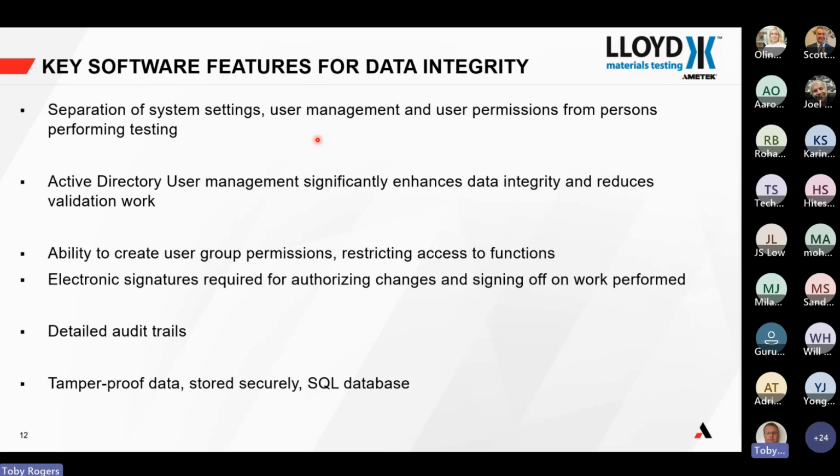And we'll see some examples. Active Directory user management, Windows Active Directory user management significantly enhances the data integrity and reduces validation work, and we'll look at that in more detail.